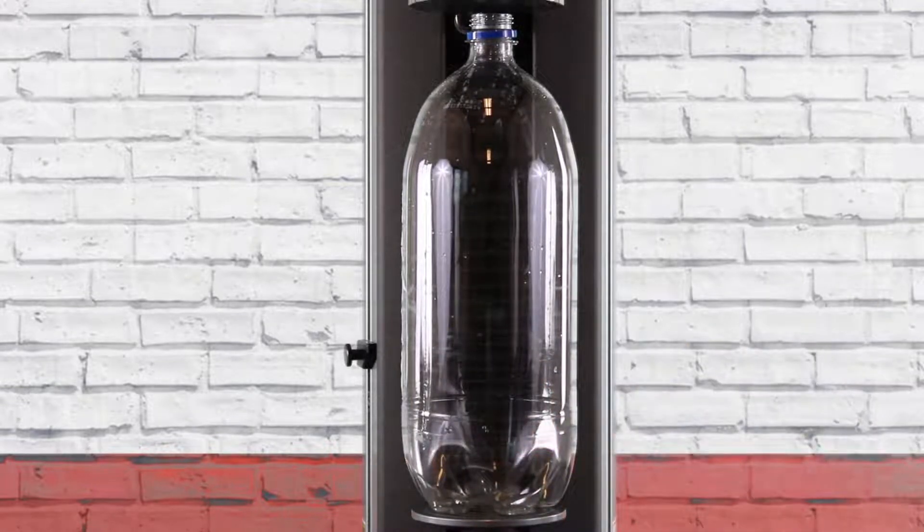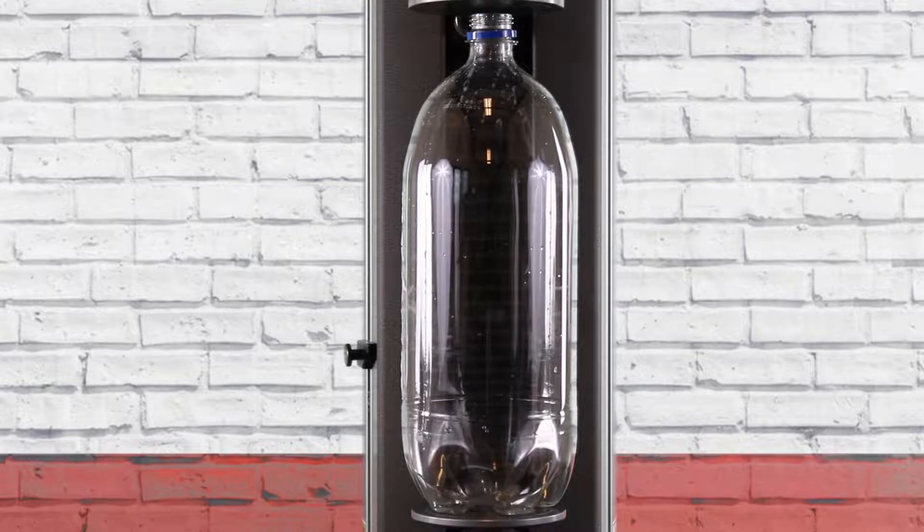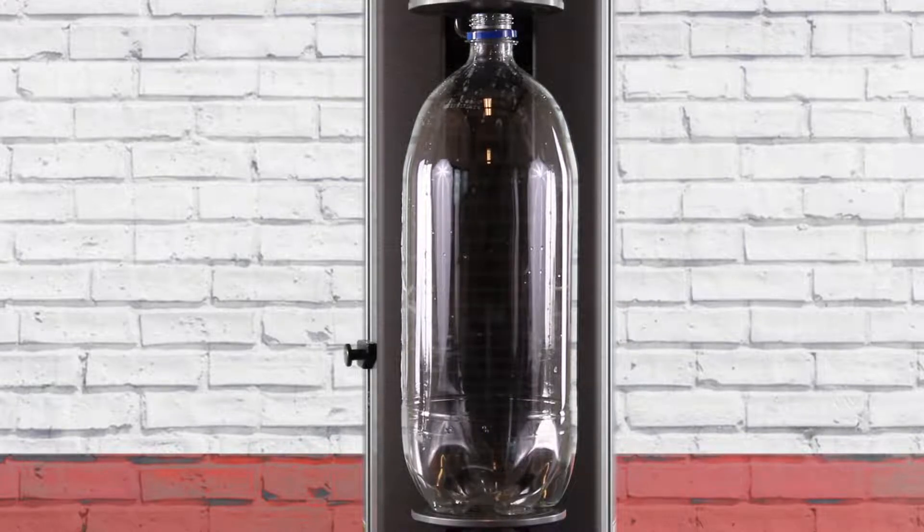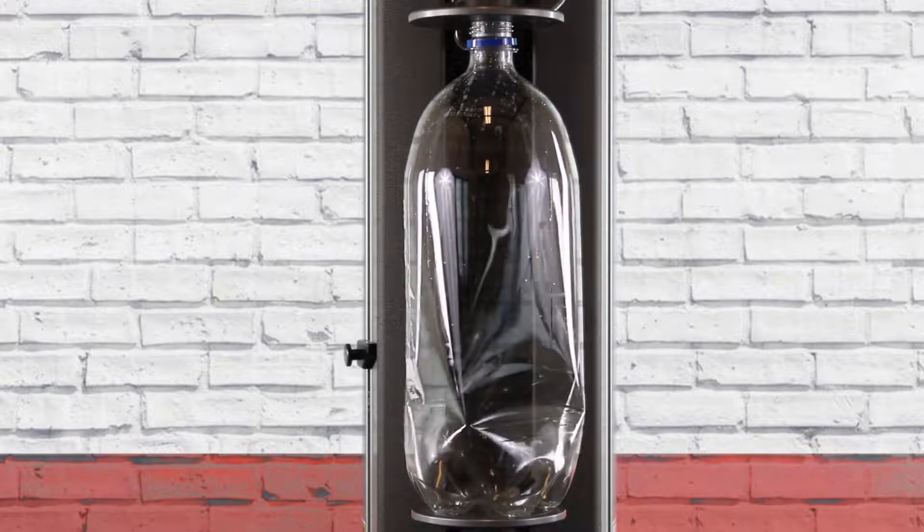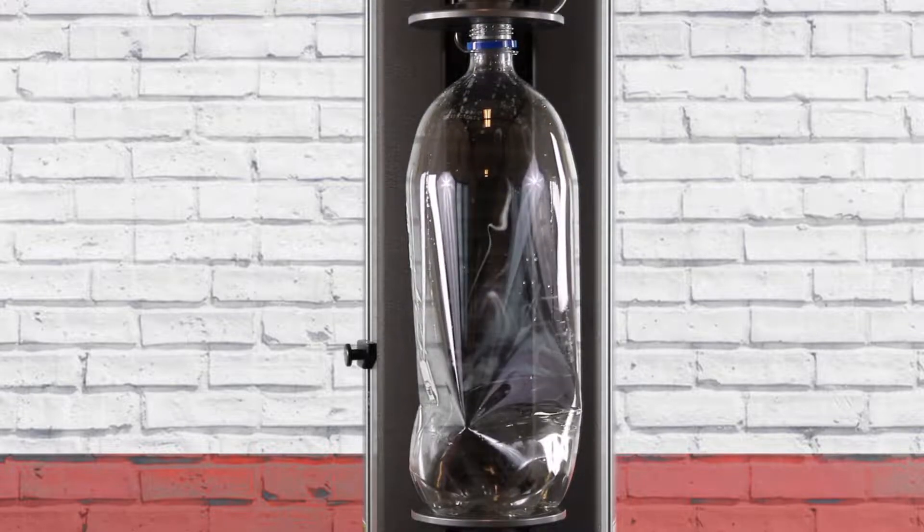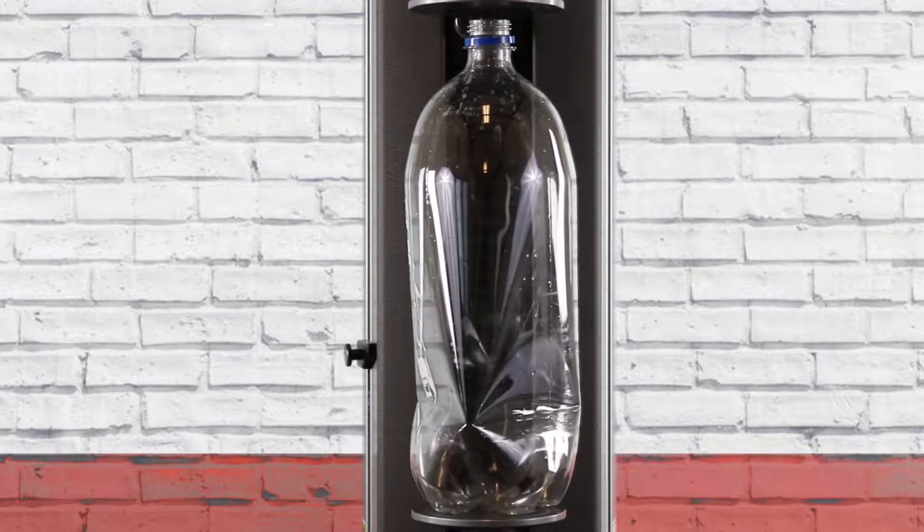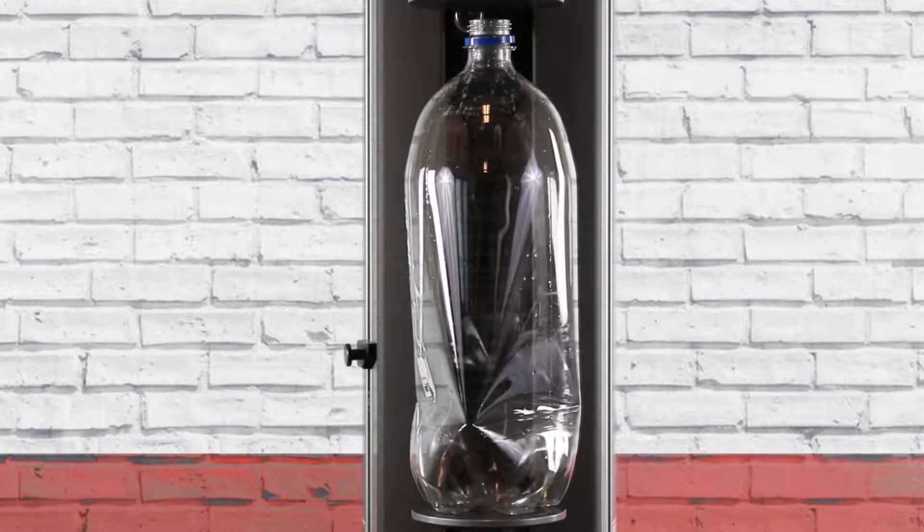Here's the second test, see the system coming down, applying the load to the bottle, and that's it.